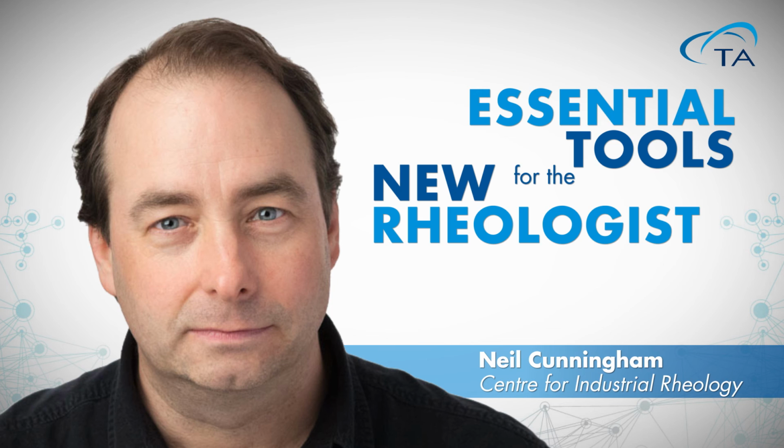Okay, thanks, Dave. From a practical point of view, there are various different methods of measuring thixotropy. The old traditional type, which is performing an upsweep followed by a downsweep, I tend to stay away from, and I prefer to run three-step methods. A three-step method involves a period of either small deformation, small stress, or low shear rate, and then stepping up to a high deformation, high stress, or high shear rate test, and then holding that for a period of time to destroy sample structure, and then dropping down again to the gentle regime, the small shear rate, small strain, or small stress. The good thing about that method is that within each individual step, you've only got one variable, and the only variable then is time.